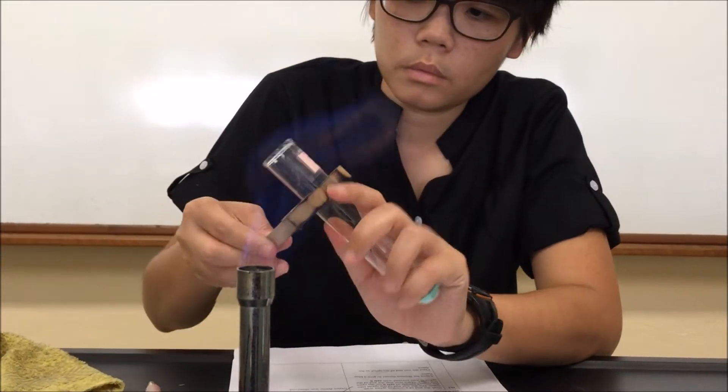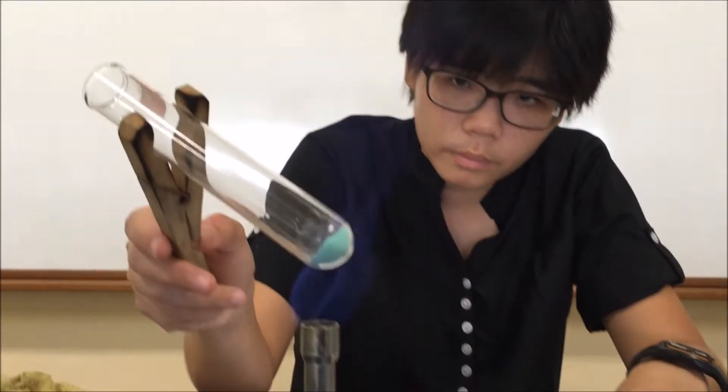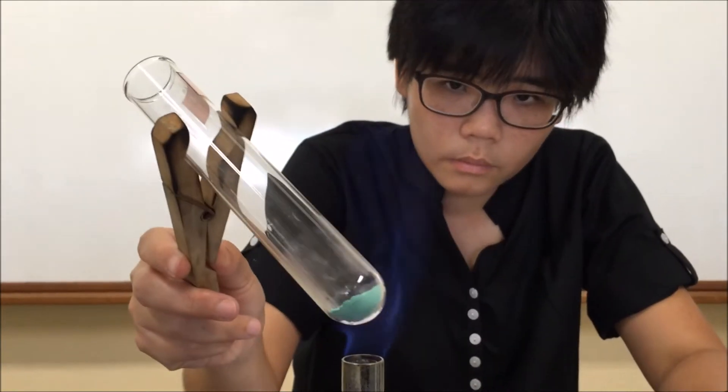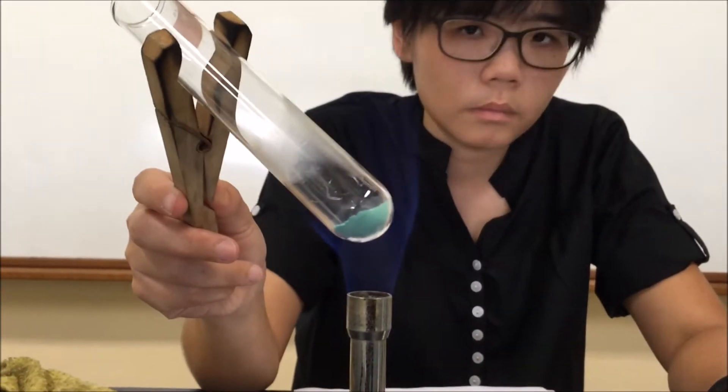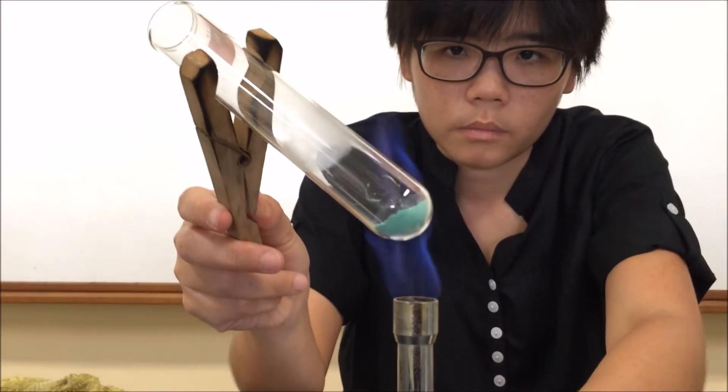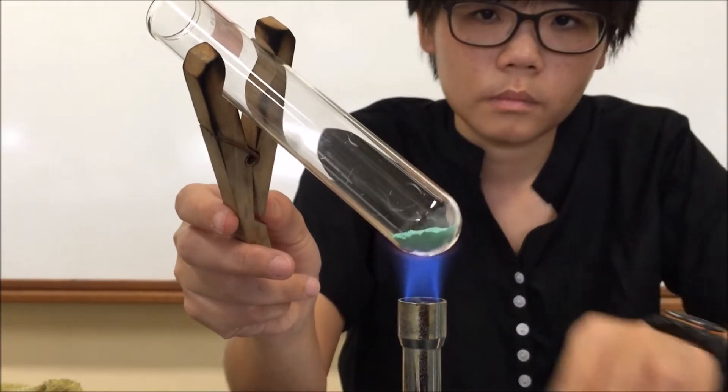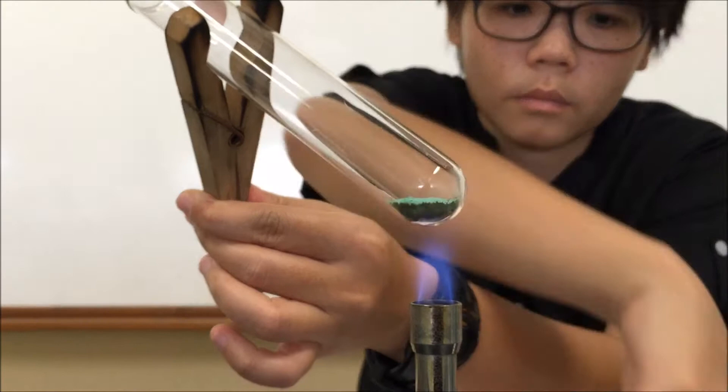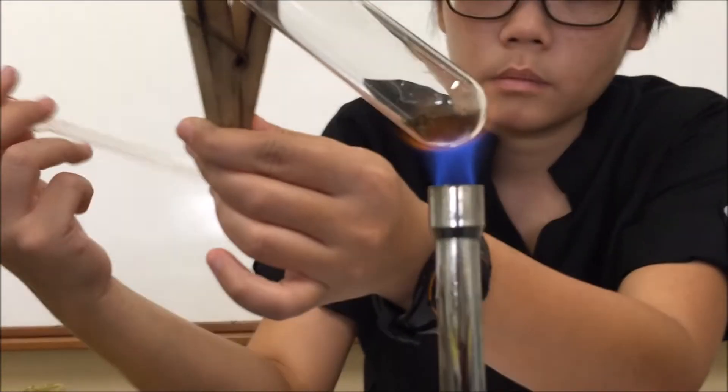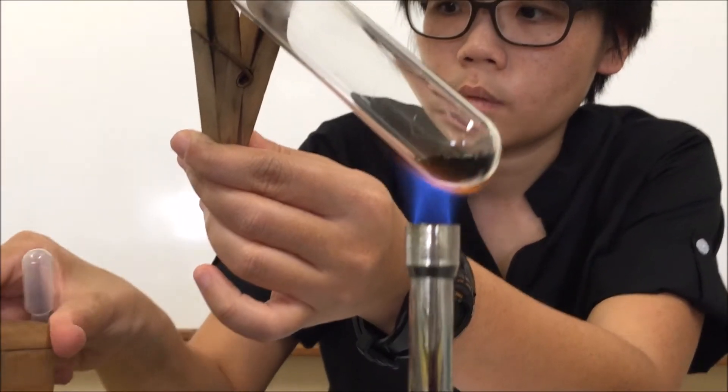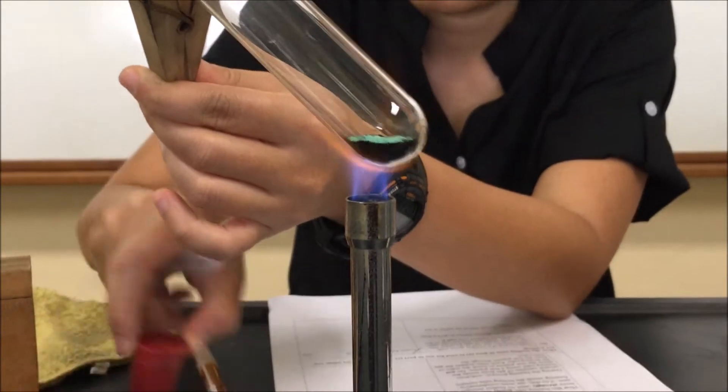Close the air hole, heat gently. And then open the air hole to heat it strongly. Always put the tube at the tip of the small triangle. So we should always pay attention to all the changes happening in the tube. So we see that the green solid is turning black.